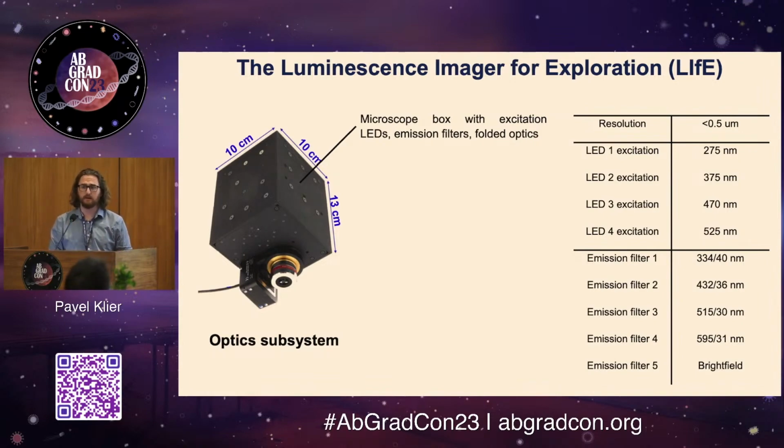And that's really good at exciting protein fluorescence. So tryptophan, phenylalanine, the various aromatic amino acid side chains actually fluoresce quite brightly in the ultraviolet. That can help image native fluorescence of samples and also excite the fluorescence of many different kinds of minerals.